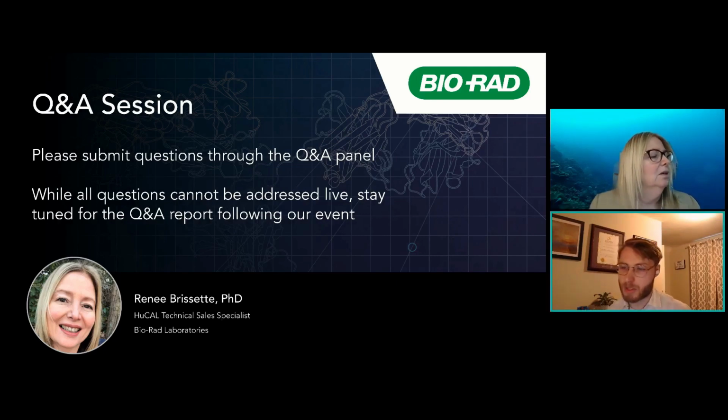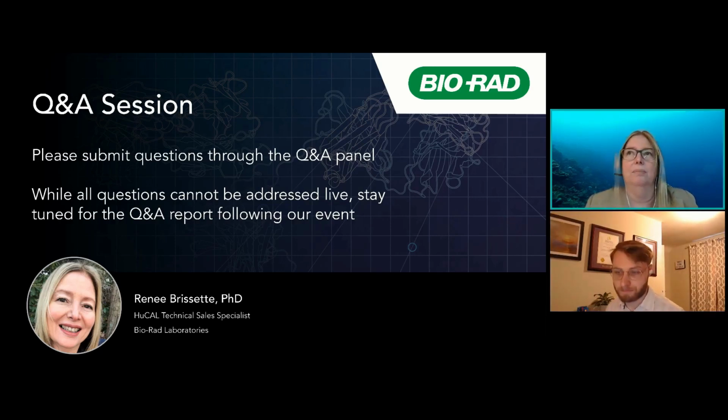Is it possible to generate antibodies to things like DNA or carbohydrates? Yeah, that's a great question. Those are historically difficult antigens to generate antibodies to, but we're more successful with those types of antigens because in the in vitro phage display process, we don't require an immune response, and we're also successful, for example, with self-antigens, which are also difficult targets.